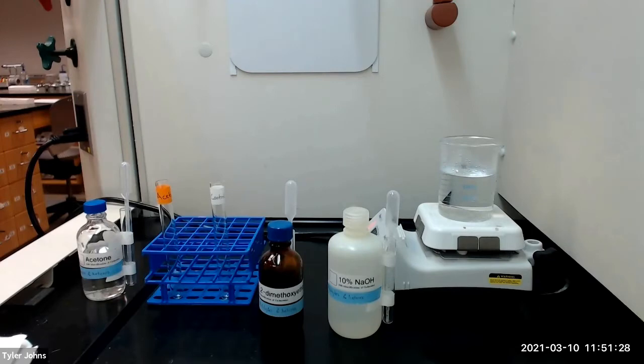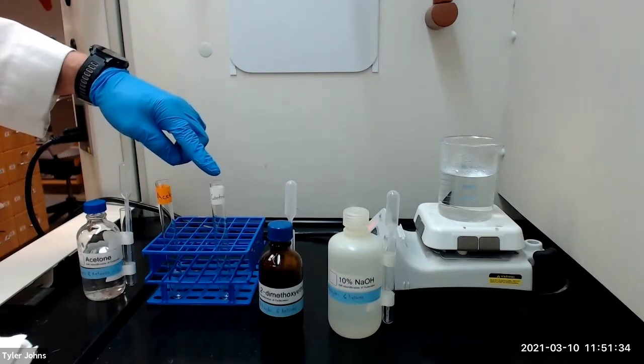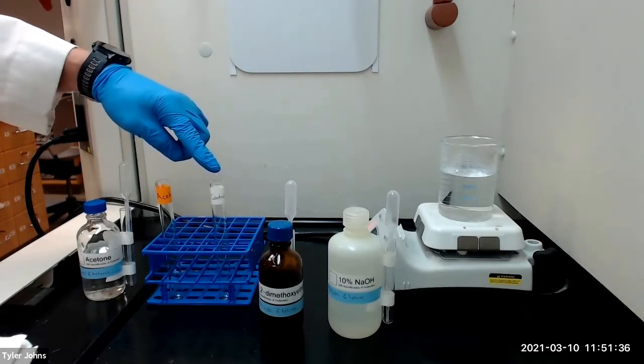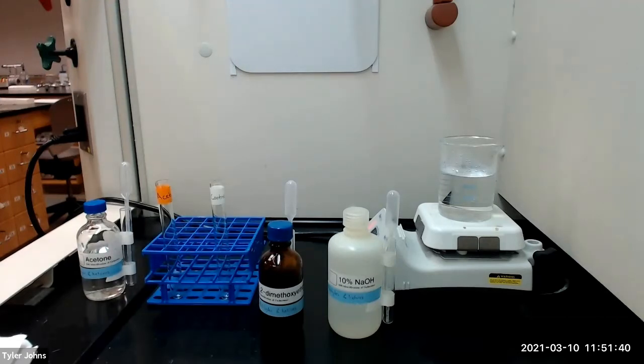We will now perform the iodoform test using acetone as our test compound, and for reference we will be using a negative control that will contain all of the reagents except for the acetone. The iodoform test allows us to determine the presence of a methyl ketone or a compound that is easily oxidized to a methyl ketone. Other ketones will also decolorize the iodine solution but they will not give a precipitate of iodoform.